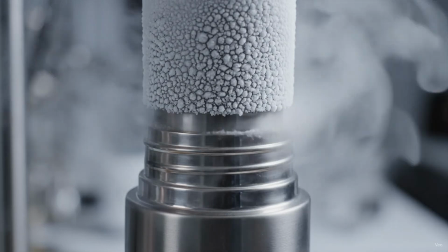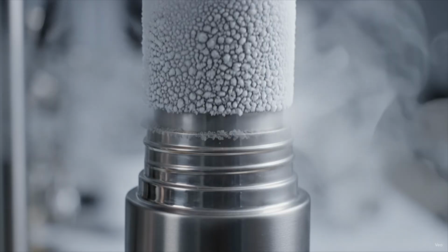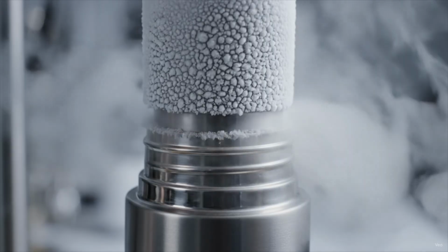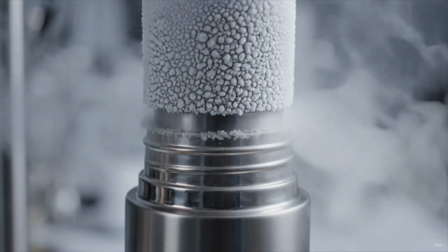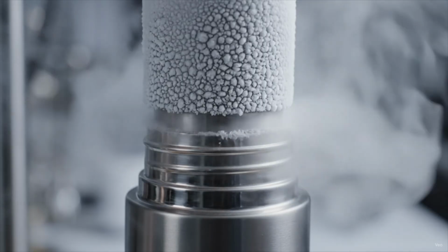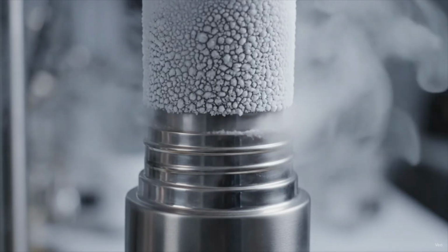In this video, we're going to talk about how you calculate the minimum gas flow you need when making liquid nitrogen. So you've gone ahead and you've bought your cryocooler, and you notice instead of a nice clear liquid at the end, it's foggy. Probably it's the CO2 and the water that is making it foggy.